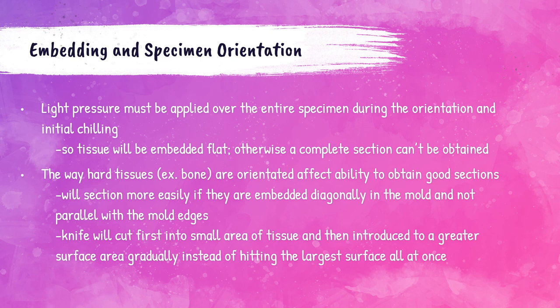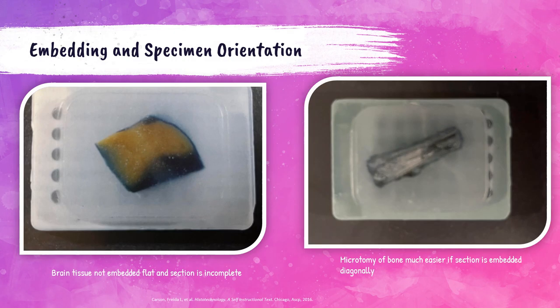When hard tissue is embedded diagonally, the knife of the microtome will first cut into a smaller area and reach a greater surface area slowly, allowing the specimen to be cut much more easily. One photo shows brain tissue embedded improperly — light pressure was not applied over the entire specimen while being chilled, resulting in it not being embedded flat; the darker area at the top has not been sectioned. The blue color is caused by an indicator desiccant in the absolute alcohol. Another photo shows a properly positioned and embedded bone specimen; microtomy of bone is substantially easier when the bone is placed diagonally in the embedding medium.